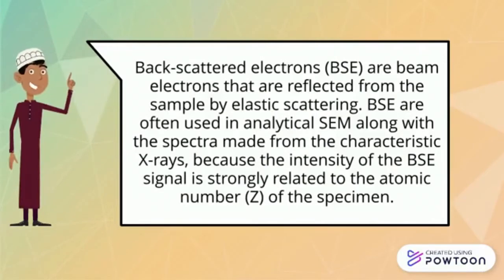BSE are often used in analytical SEM along with the spectrum made from the characteristic X-rays, because the intensity of the BSE signal is strongly related to the atomic number of the specimen.